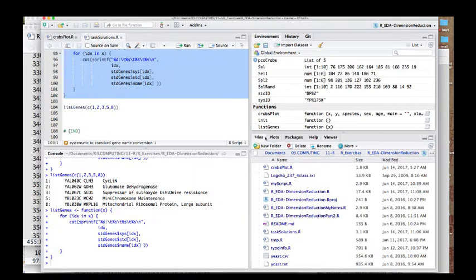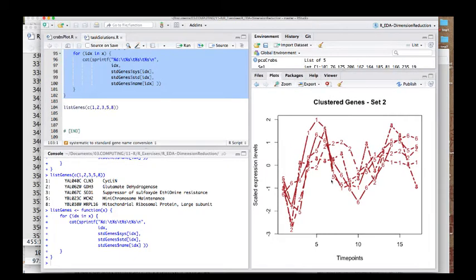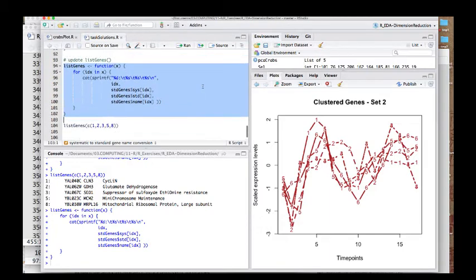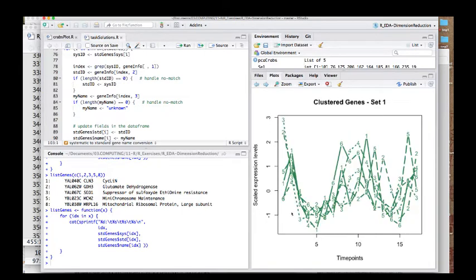Let's have a look. We found some genes clustered on the PCA — set 2. They're kind of similar. As you know, if gene expression profiles are similar, one possible reason is that they are co-regulated. Genes would be co-regulated if they need to be expressed under similar conditions in the cell, because often they have some kind of related function — they collaborate. So the idea is that co-regulated genes also participate in similar functions.